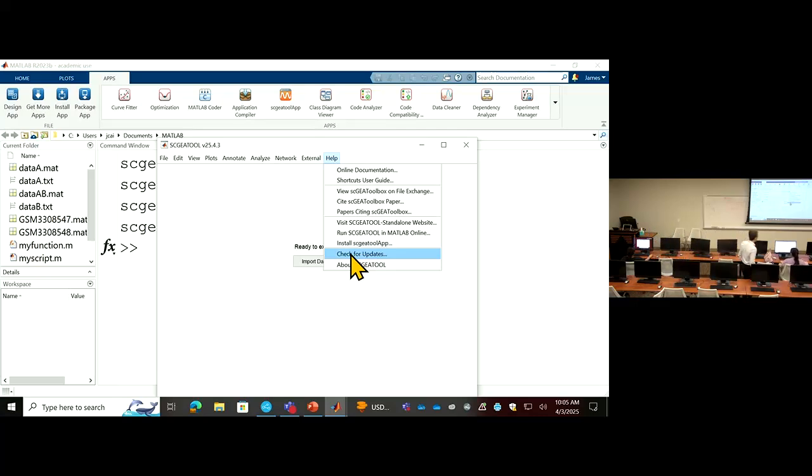You got it? Yeah, because you are using the old version, this is not working. So I checked for update. You check update, and you see, yes, nothing happened. Oh, okay. Because this version is too old. So what you can do, like I said last time, is delete the whole thing if you can.